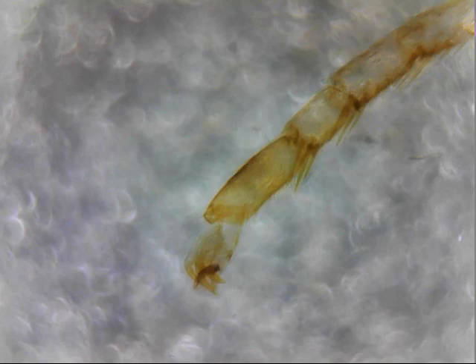So yeah, you have a little bit of a thing right there, but it almost looks like a hand. That's creepy. Can't you see that looking like a hand? Doesn't it look like there's a hand holding something? Like a thumb and like 3 fingers? That's creepy. And that's a butterfly leg. Oh, it's a whole mount, too. Just want to clarify.